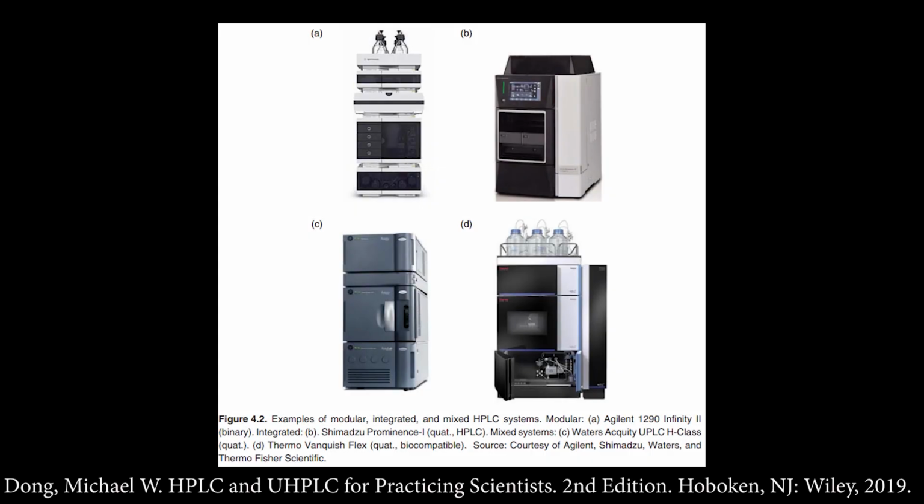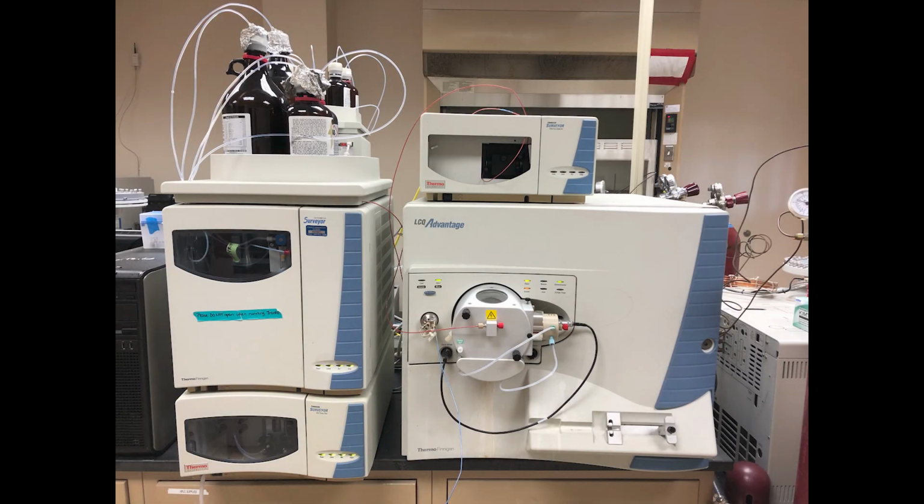So you're going to see a lot of the Thermo liquid chromatography systems. That's what we have. I am a big fan of the Thermo systems. Ours are a little older, but you can see they all look pretty similar. Logistically, they're going to make these into stacks, so they don't take up much space on the bench, and then gravity helps the solvents flow. So you can see they have kind of the basic shape for all these different commercial varieties. They're going to be modular, and they're going to be these stacks with these different units that stack up on top of each other: pump, auto sampler, detector, degasser, etc. So you saw that other HPLC stack that had a UV detector. This is a similar stack. It has a UV detector, but it also has that mass spectrometer, that big box next to it.